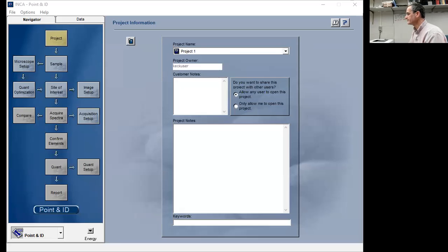Okay, so this is the Inca system here. The Inca system can grab data from the electron microscope and control it for analysis. We're going to set up a project. We'll call it Modern Physics. Or how about Modern 2020?